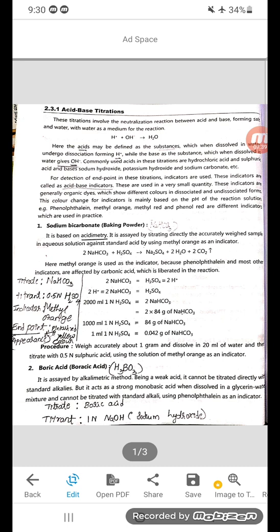Another important compound is ammoniated mercury, also called amino chloride of mercury, and its assay is based upon acid base titration. The sample is dissolved in a solution of potassium iodide first, then the precipitate of mercuric iodide, HgI2, dissolves in the excess of potassium iodide with the liberation of an equivalent amount of alkalis, as ammonia and also potassium hydroxide.